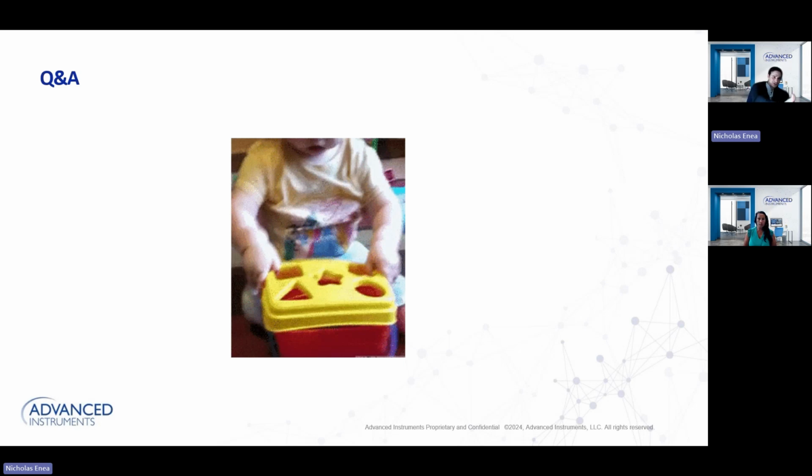Because as Candy mentioned, once it's in the SOP, it's almost like law, and trying to revert those SOPs takes a lot of revalidation and a lot of work, depending on the quality team and the organization. So be cognizant before you put it into your SOPs and make sure it's data-driven. If that customer had checked a liquid handler at 1 microliter and found that it normally hits around 10% every time, they could set the tolerance around 12% because they know that's achievable, and their assay results will be right in line as well. So that's very, very important.